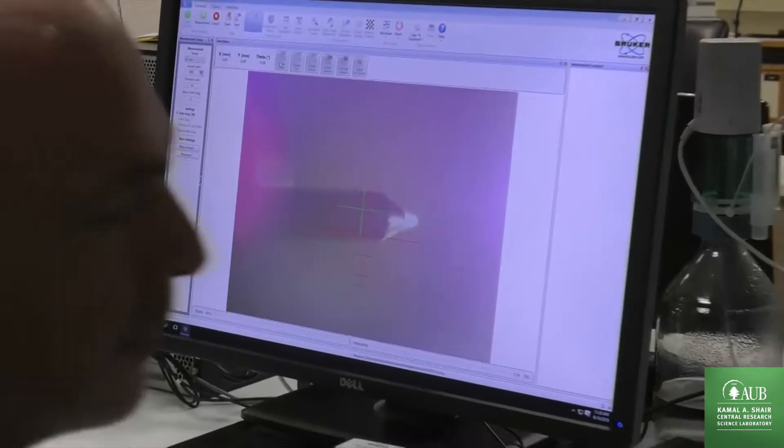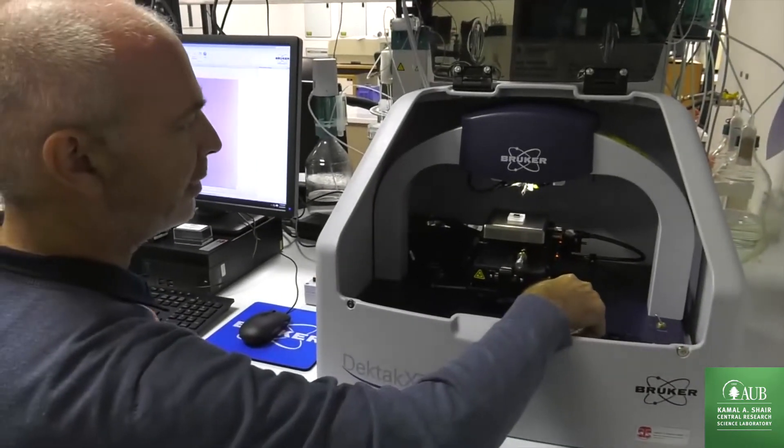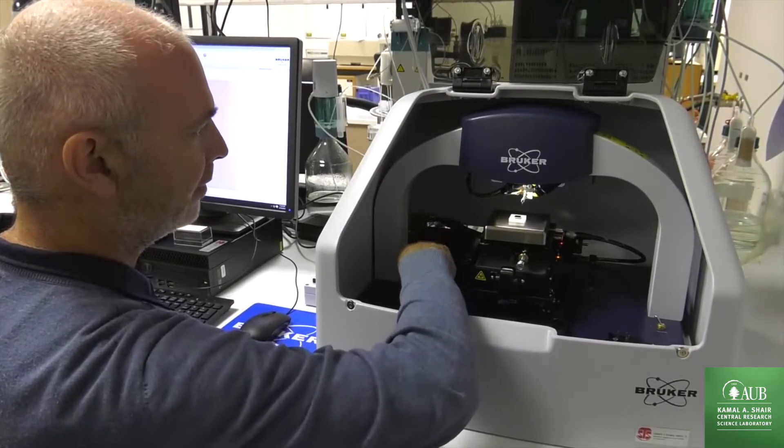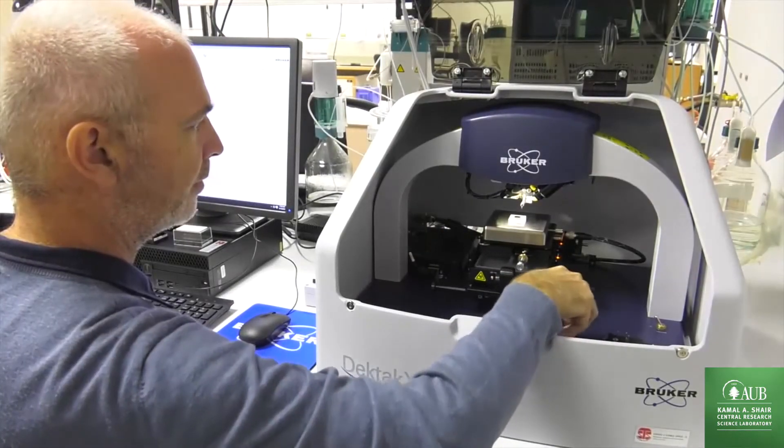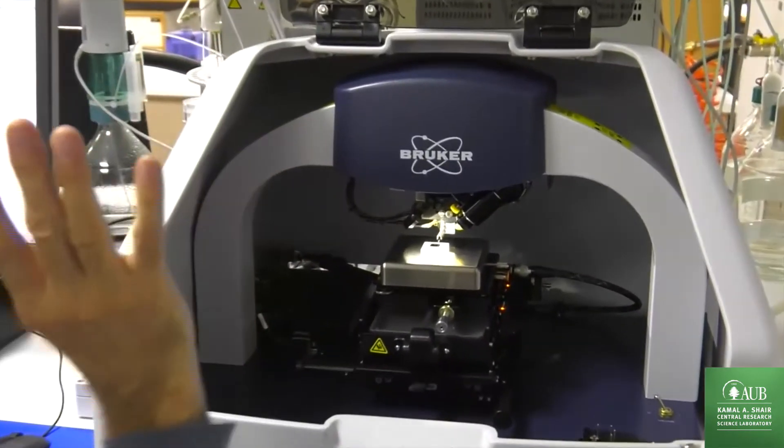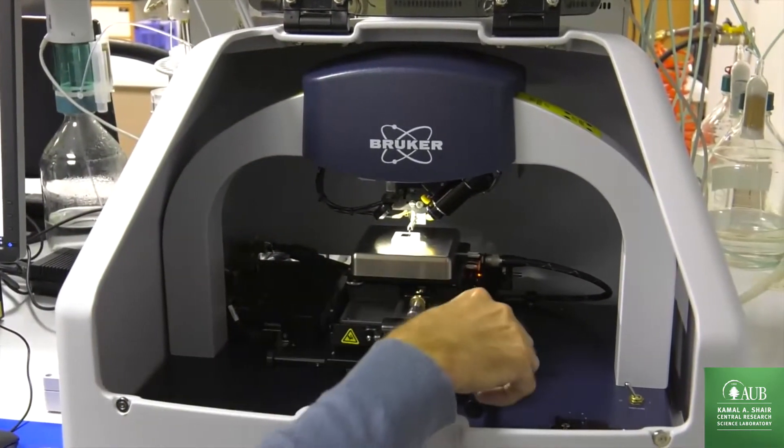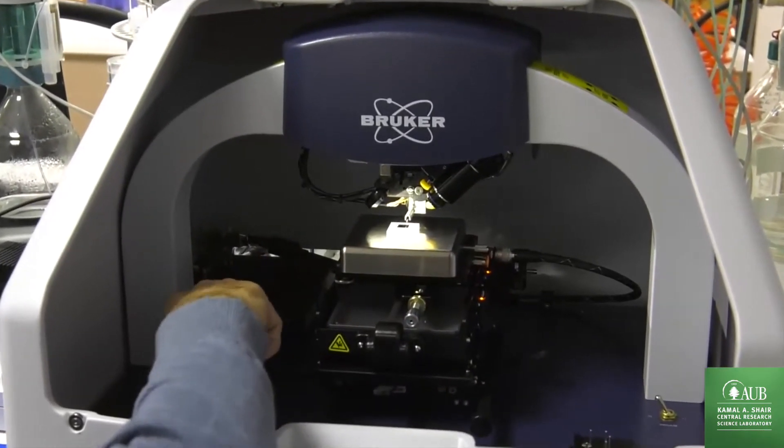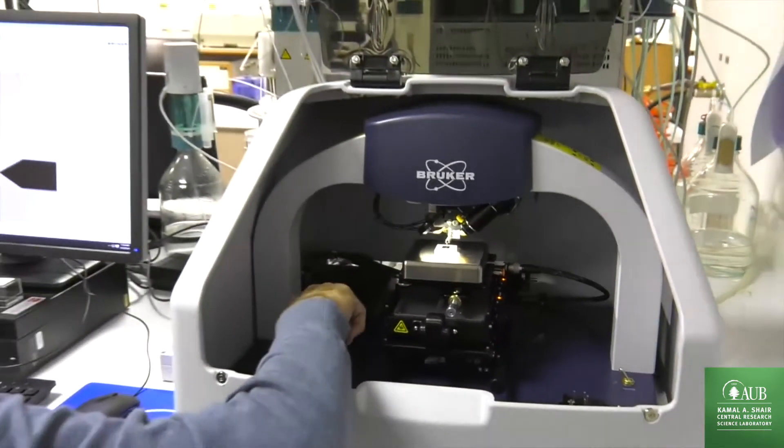Make sure that the stylus will land on the correct spot of the sample and we navigate to the really intended measuring point.